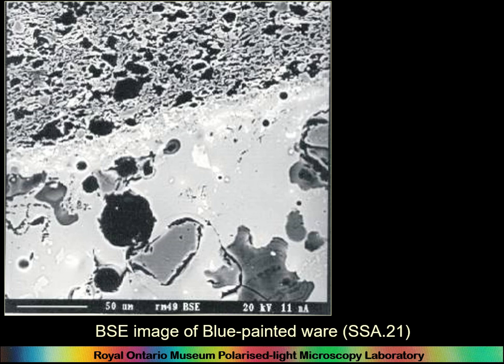We have pottery from excavations which put it in that date in Susa and other sites in Iraq. And we also have this sequence which explains the development, where the early pottery with tin in the glaze would have had a little amount of tin in it, and it just stayed on the surface.